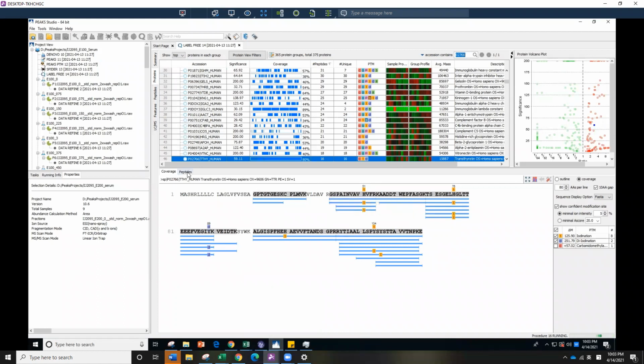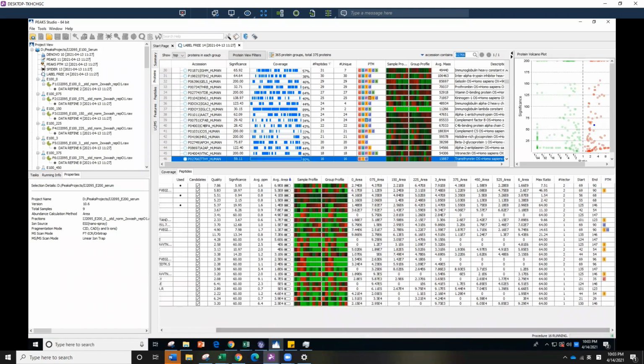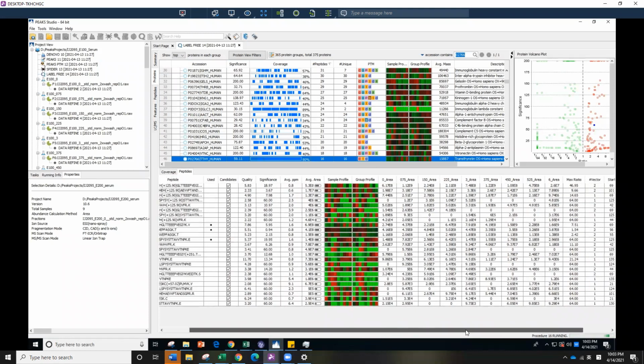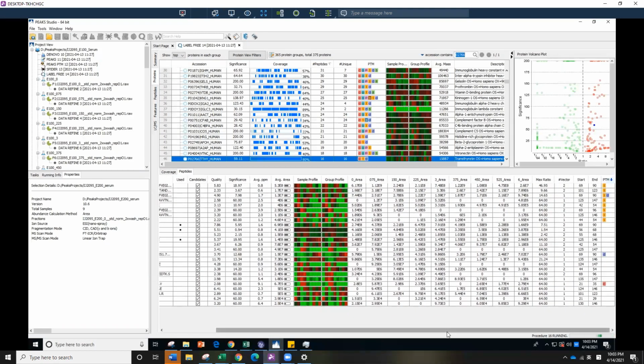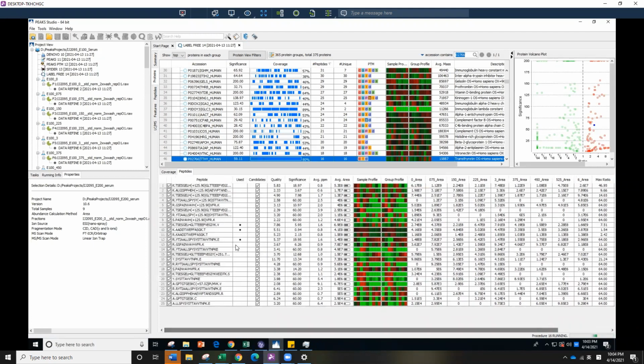After you have your exported peptide data, I'm just going to start from here. Here you want to see an iodine label. So you can sort it by PTM type, and iodine 125. Let's start from there. You can see everything up here has iodine. Let me just select one of them. I think this should start from 69 to 90. So I think this is the 76.